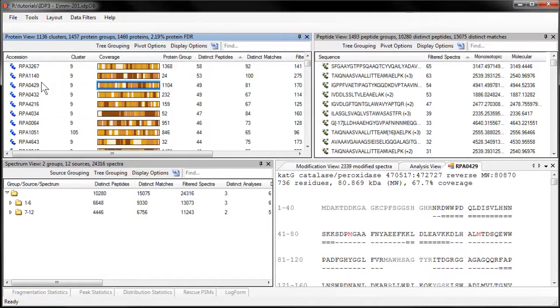The key column, the one that must be unique, is always on the left and is always visible. For proteins or protein groups of one protein, it's simply the accession of that protein. For multi-protein groups, it's all of the accessions of the proteins in that group combined together. That can get very long, but it's what we do instead of picking an arbitrary representative or anchor protein.